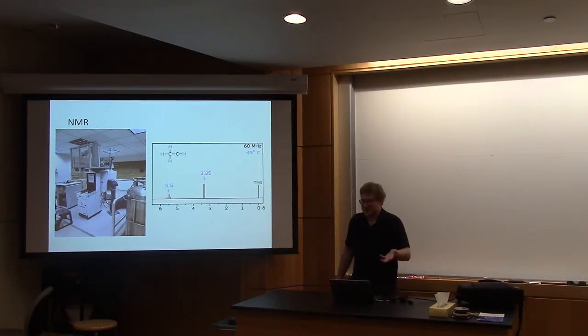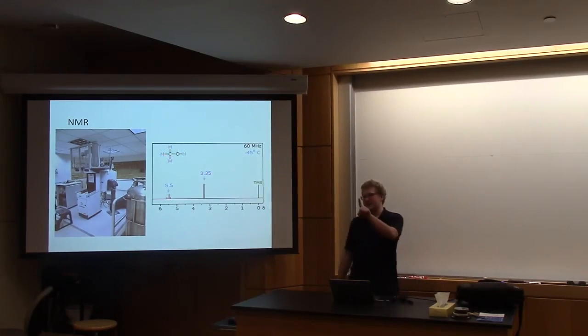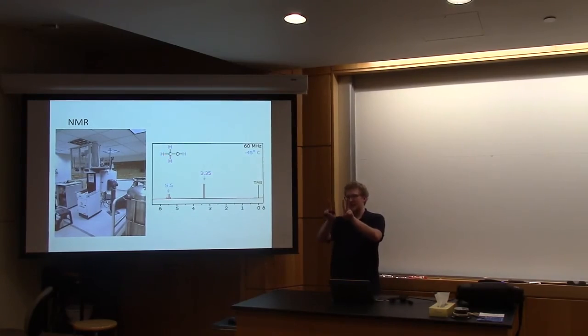Once we take all of these different facts and combine them together, we can very accurately draw up what our chemical looks like. So if you want to just take a brief glance at this example, you can see that there is a single hydrogen on this oxygen, and that if we were to integrate this peak, it would tell us there is one hydrogen. Now, why does this have 4 different peaks? That's because this hydrogen is actually being interfered with by these 3 on this carbon, which means that instead of 1 peak, it gets split several times into 4.